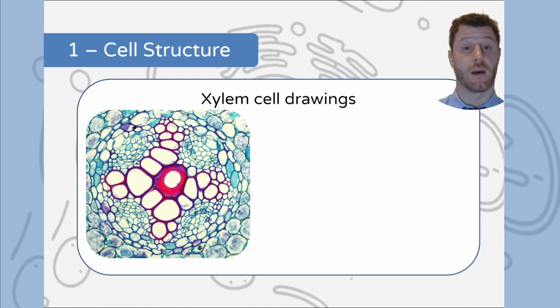And once again, I'm going to show you a video. Again, here we have the pericycle of the root, and we're going to draw 4 adjacent xylem cells, and I would pick out a section like this. I'm going to disappear again to let you watch the video and show you side by side exactly how I would draw that.